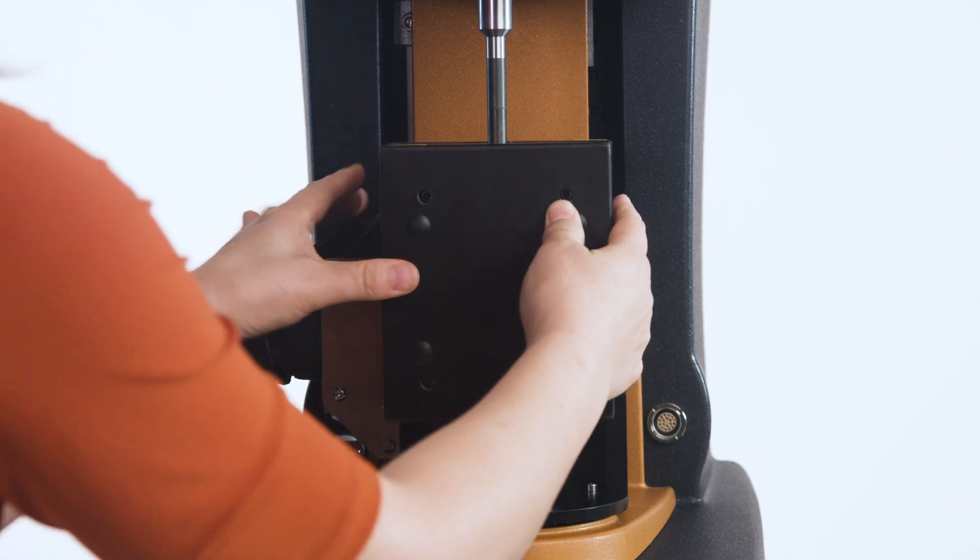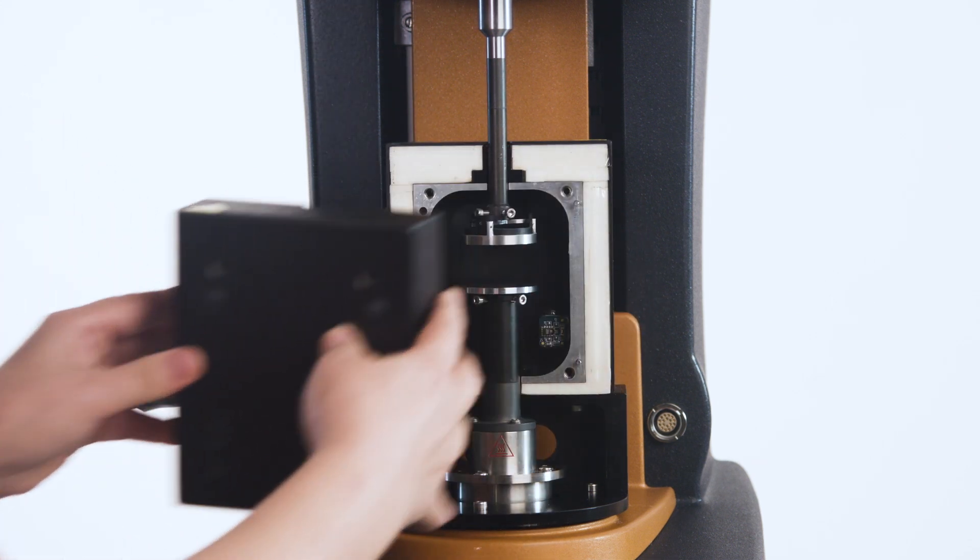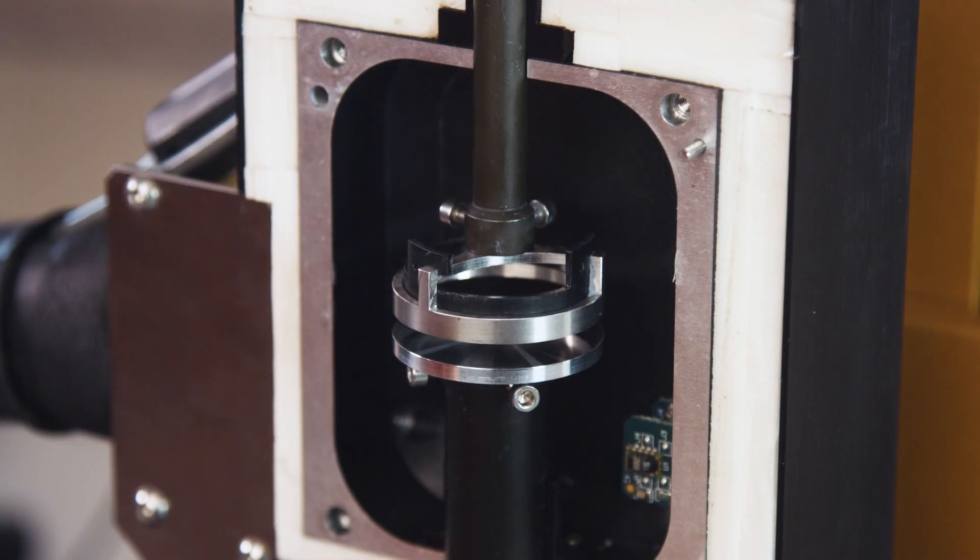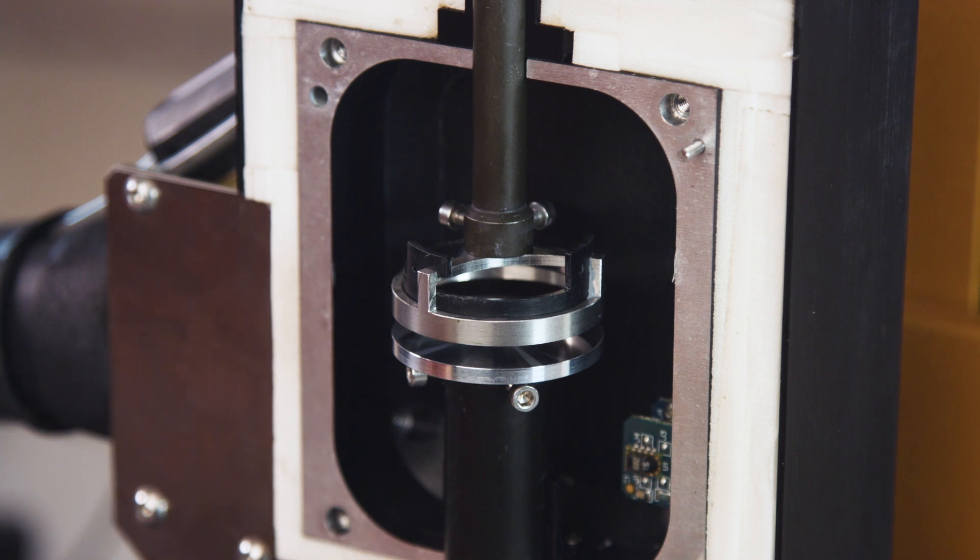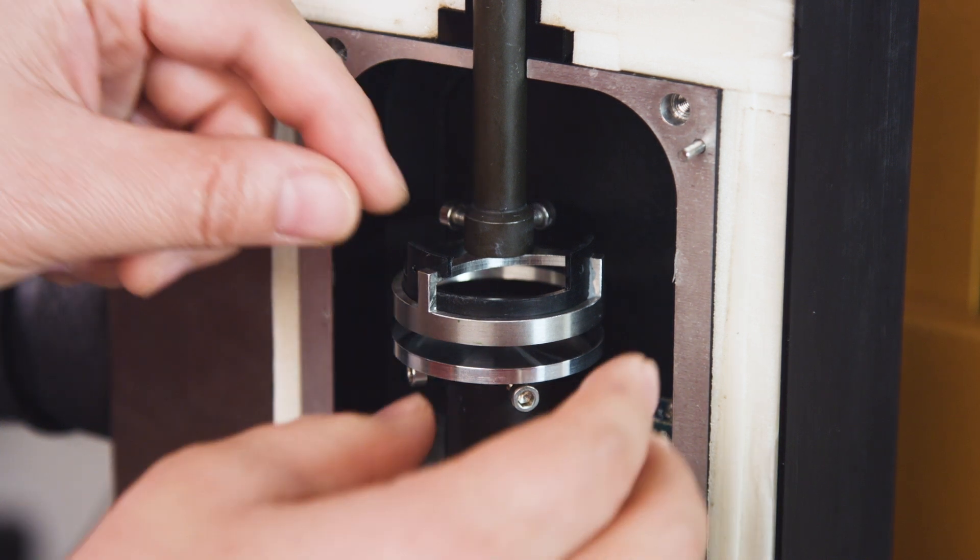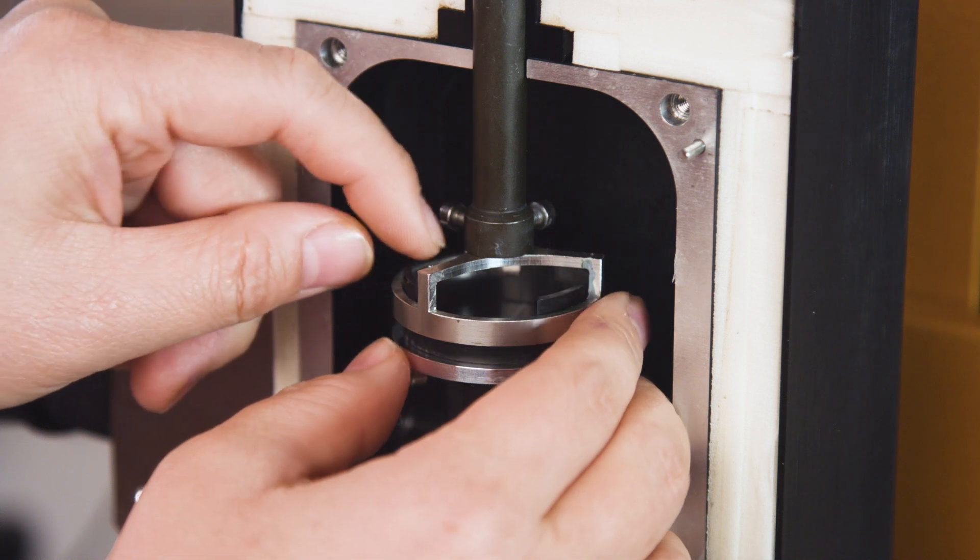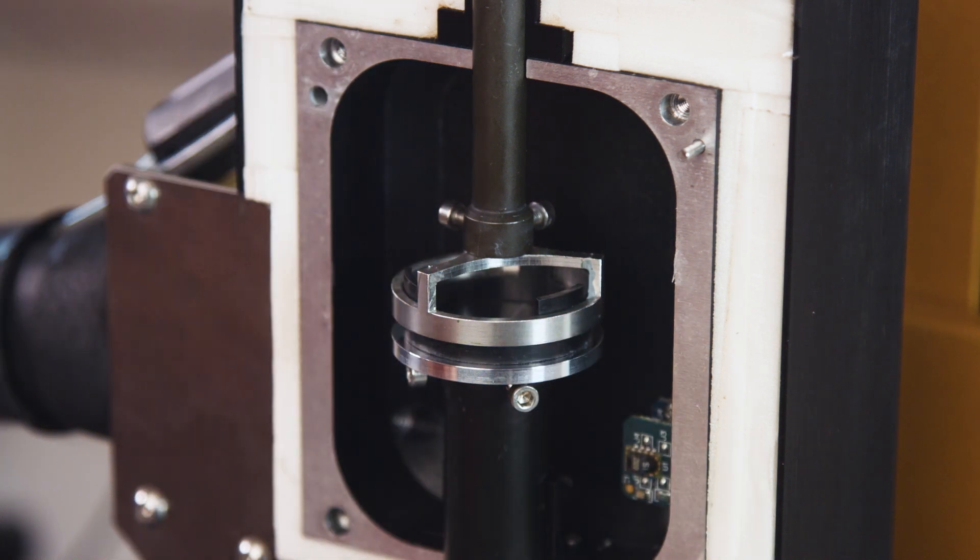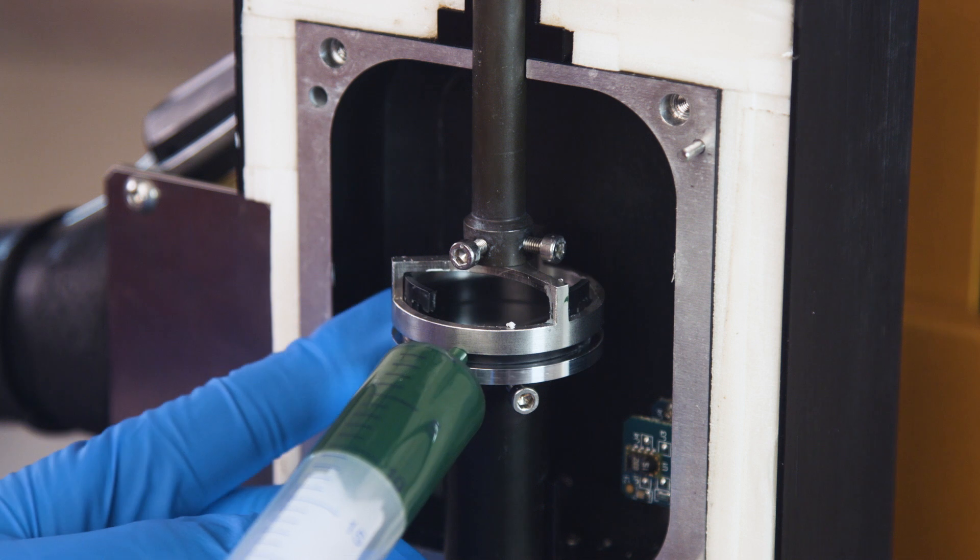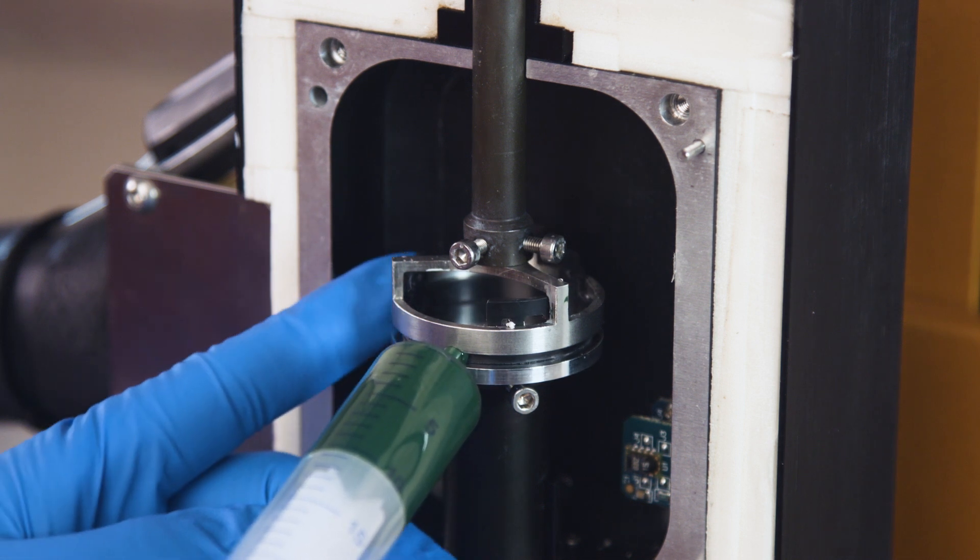Open the front face of the humidity chamber. Lower the upper geometry until it reaches a gap between 2 to 3 mm. Release the inner trim ring until it is sitting on the bottom plate. Load your sample to the annular ring.